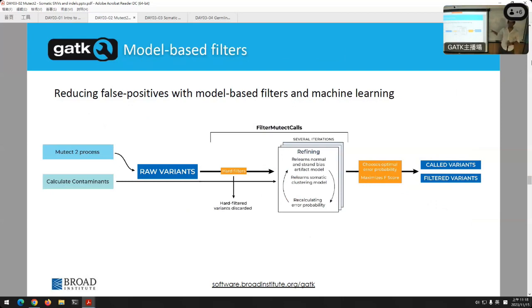Looking at it as a whole, is that a better interpretation of that data, to maybe filter that one or not filter that one? And if so, we loop. We go back in, we say, that made it a little better. Let me try it again. Let me recalculate the probability. Let me recalculate which ones are good, which ones are not, and make another tweak. What if I tweak my cutoff for this annotation? Does it make the call set better or worse? Recalculate, back in a loop.